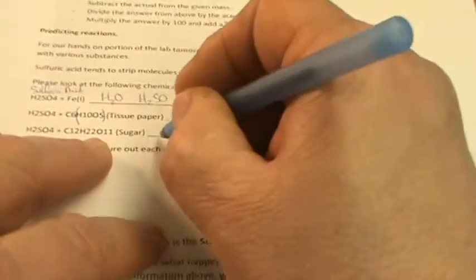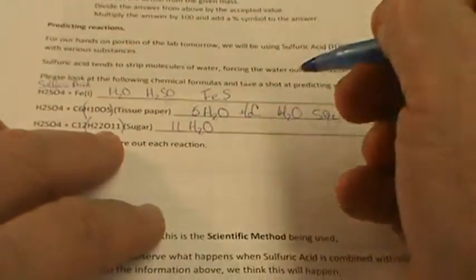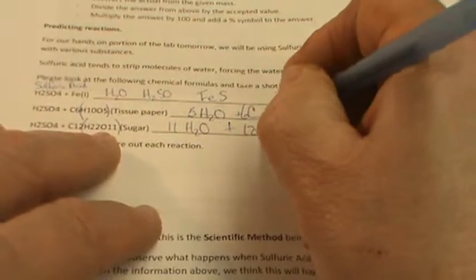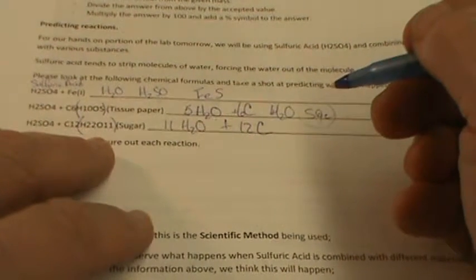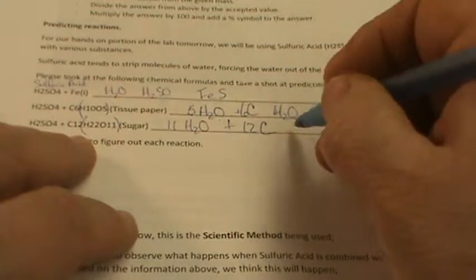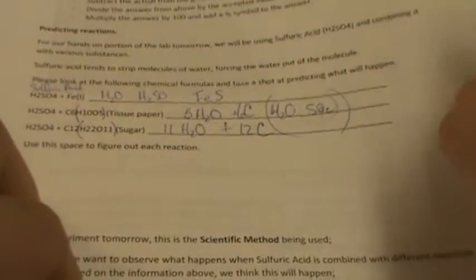In the case of the sugar, this is C12H22O11. We're going to get 11 H2Os. We're going to get 12 carbons. You'll see that in the reaction. That's the carbon, that's the column of black that we get coming up. And we can get some of these products up here at the top.